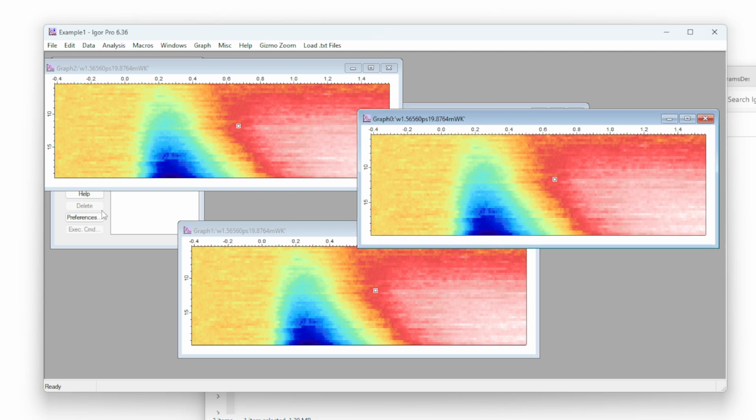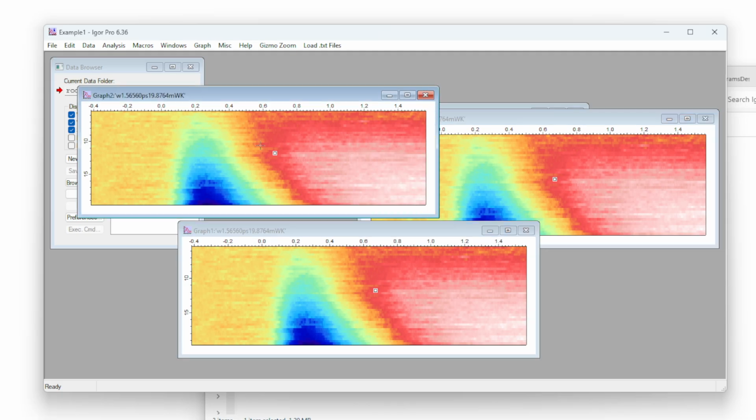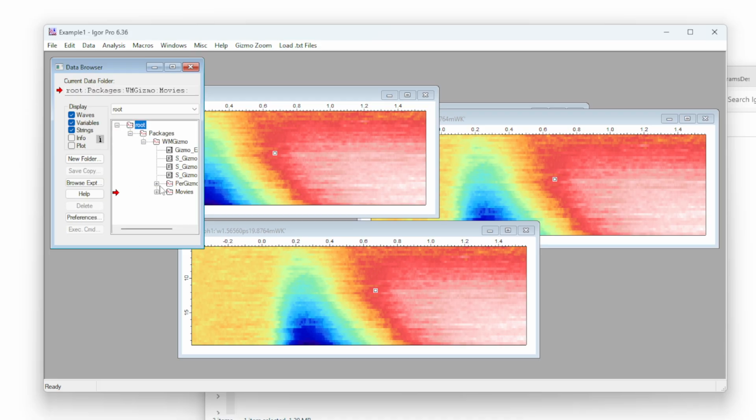The idea behind it is that IgorPro puts the last X and the last Z, the last power, in the name of the file. In this case, it's fluence. It was an example case; those values are unrealistic, but for the example of how the program works, it's fine. So it did not work. It actually opened 3 images, but if you look at the dataset, it saved only 1 file.